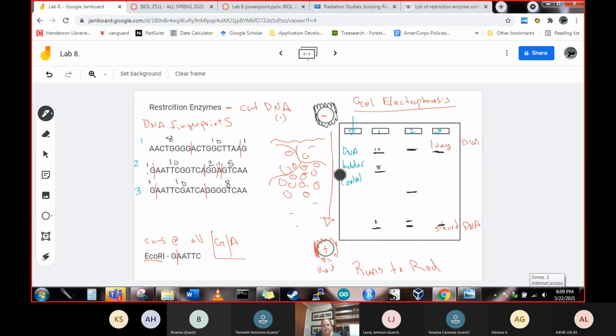And you can see that we have an 8. So our last one, actually, if you guys are watching here, looks exactly like our first one. So if we were trying to figure out which 2 of these were related, we might say number 1 and number 3. And they're the exact same sequence because they're just backwards from each other. So the restriction enzymes read DNA both forward and backward, and so you'd end up with the exact same pattern.